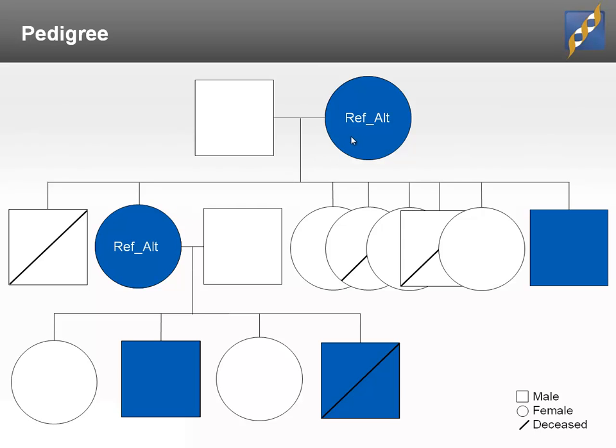The second thing we can count on then is that the 2 living males inherited the working copy of those genes and hence have a reference at the variant site that we're looking for. And finally, we would expect the affected male to have the alternate allele. Now notice there's only one allele present here, not 2. The reason being, because they're males, they have 1 X chromosome. We would expect them to be in what we call a hemizygous genotype state, where they only have a single allele. In this case, it would be alternate.